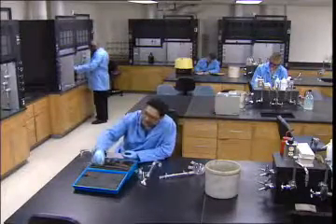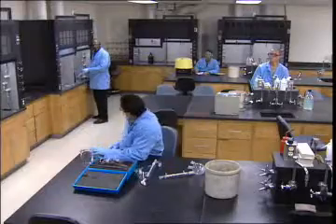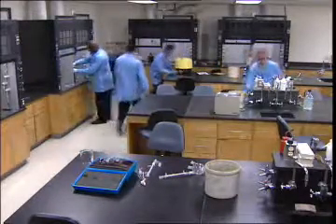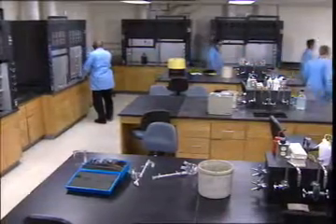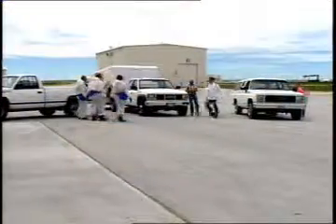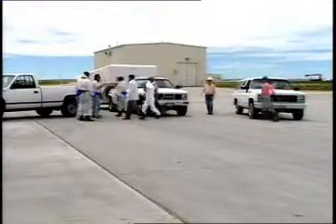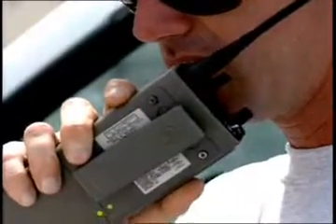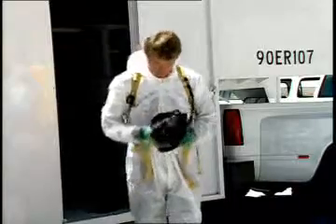Some larger-scale emergencies may require lab evacuation. You should be thoroughly familiar with all designated evacuation procedures. You should know how to get out of your work area quickly and the location of your headcount area. For larger-scale emergencies, most facilities have a designated team that is trained and equipped to respond to hazardous material spills or emergencies. This team will deal with emergencies that pose a significant threat to human health or the environment, such as a large-scale spill, fire, or explosion.